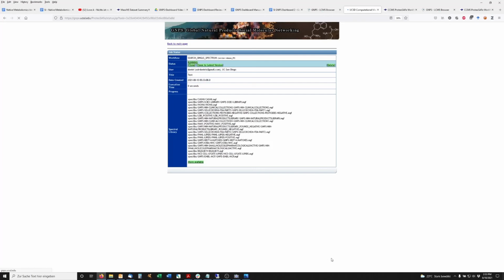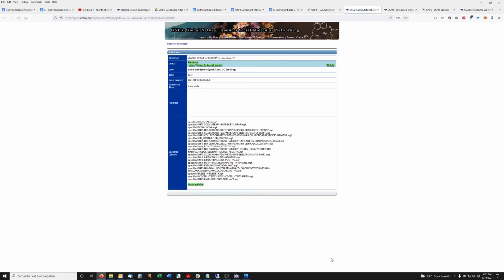So yeah, I hope this is useful for you, and you will find some applications for your particular data analysis needs.